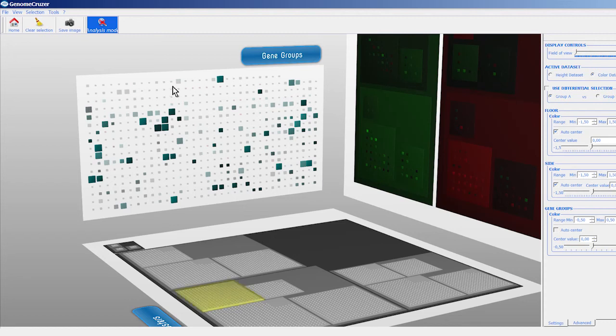In particular, bigger groups are those for which the members are more represented than expected within the gene cluster selection. For example, here we have 6 times more than expected objects represented within the cluster B4. The transparency is inversely proportional to the significance of this enrichment.